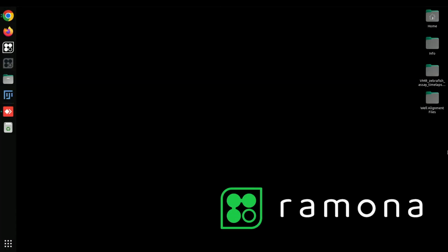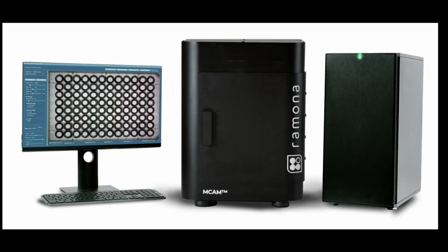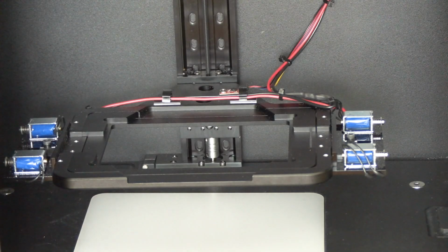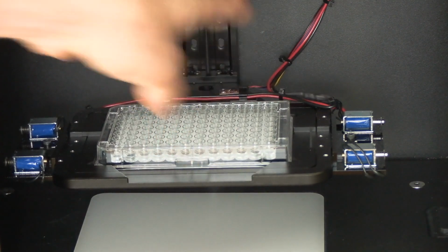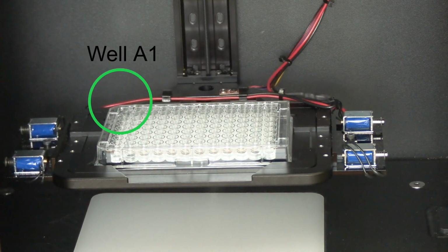In this tutorial we're going to walk through the steps to acquiring a Z stack with the multi-camera array microscope, also known as the MCAM. First, place your 96 well plate with zebrafish into the MCAM. Please make sure the well plate is oriented correctly so that well A1 is in the top left corner.